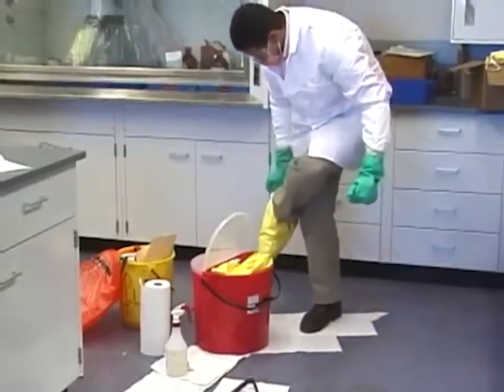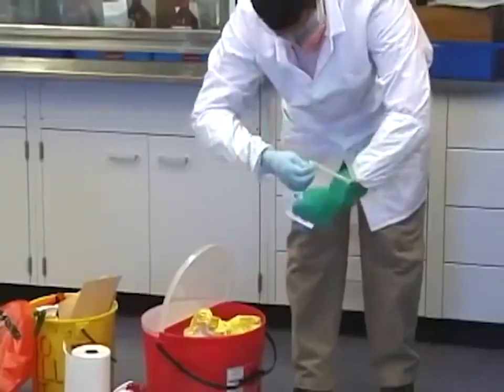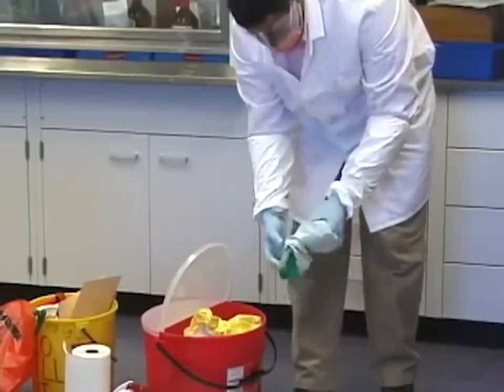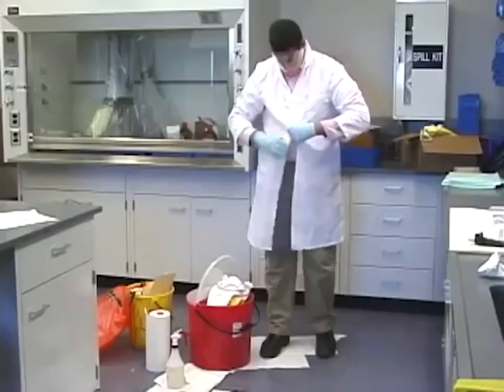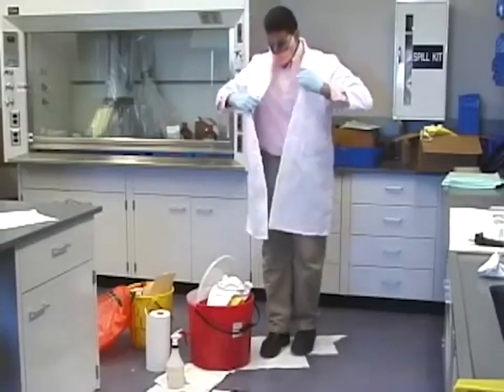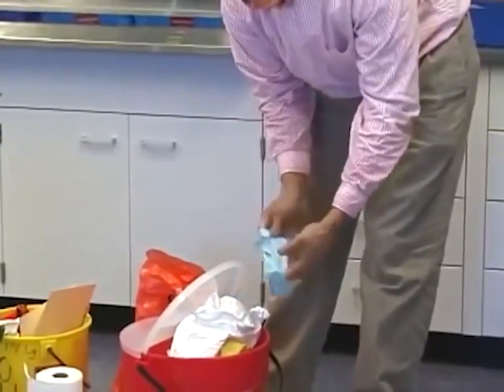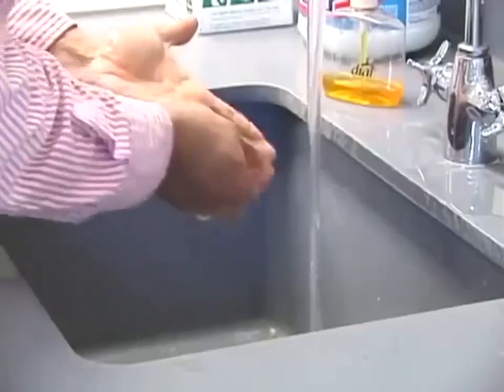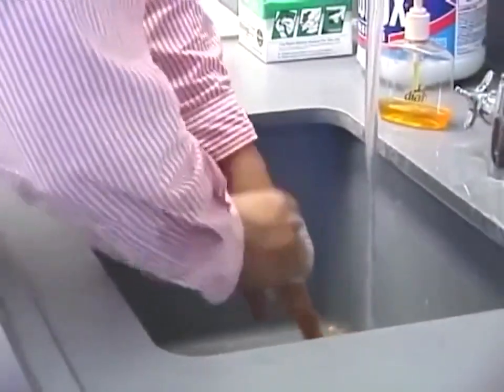When finished, carefully remove your personal protective equipment by removing your shoe covers first, followed by your outer gloves aseptically, sleeves if worn, lab coat, inner gloves, and face protection. Of course, you should always wash your hands thoroughly after removing your personal protective equipment. And don't forget to inform others that they can return to work now that the spill has been safely cleaned up.